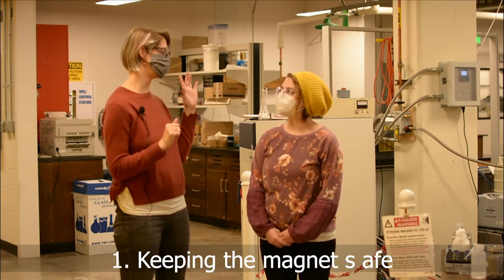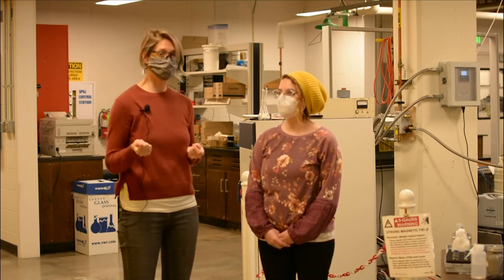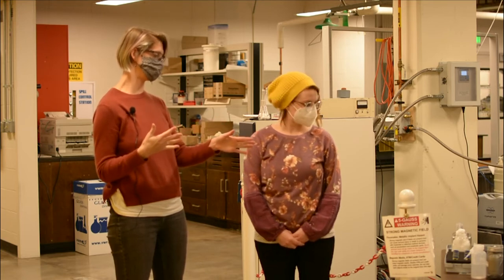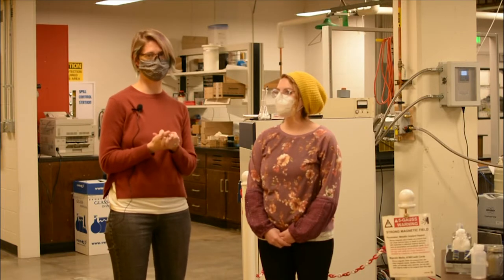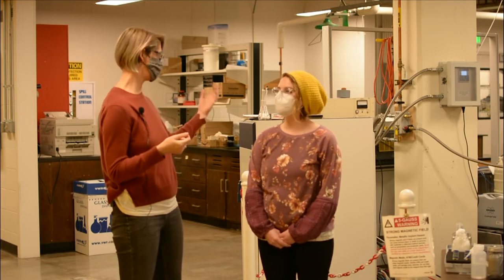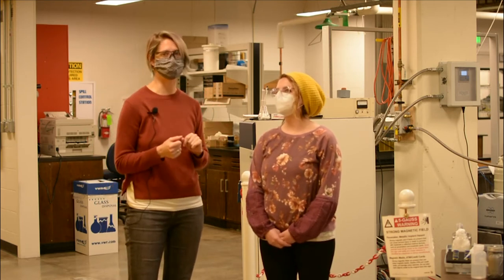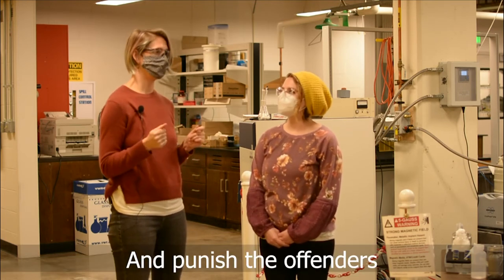In regard to keeping the magnet safe, if you're going to enter this magnetic field or approach even a shielded magnet, you don't want to be carrying anything metal in your hands — a screwdriver, a wrench, or anything that might be attracted to the side of the magnet. If you come in to run an NMR sample and discover that something is stuck to the side of the magnet, make sure you don't try to remove it. Contact one of the MMA staff to help you solve the problem.